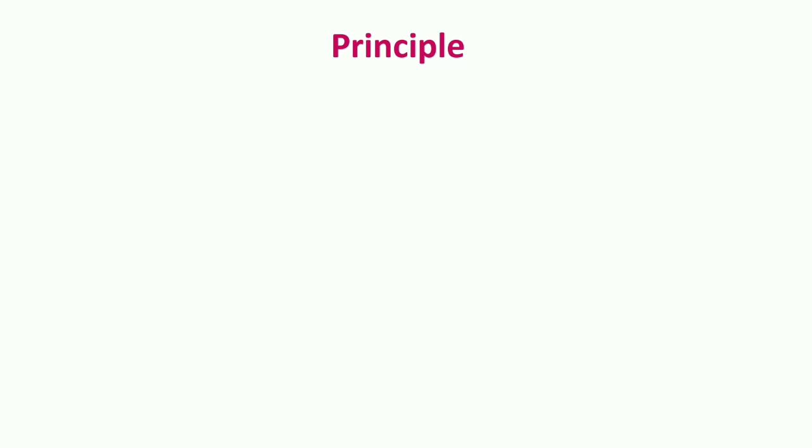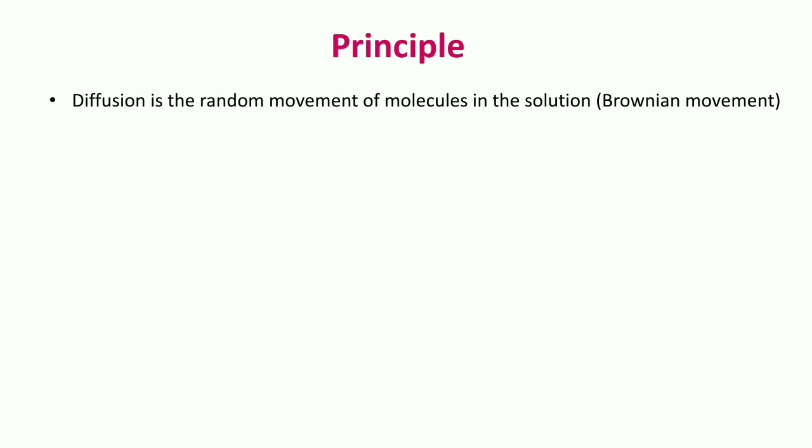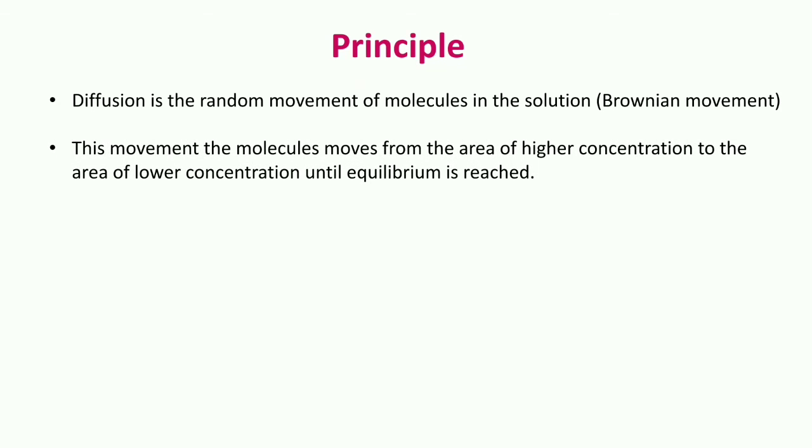Let us move on to the principle of dialysis. Diffusion is the random movement of molecules in a solution. This diffusion is generally associated with Brownian movement of solute or solvent molecules in the solution. This movement of molecules from area of higher concentration to an area of lower concentration until an equilibrium is reached is the main principle on which the technique of dialysis lies.